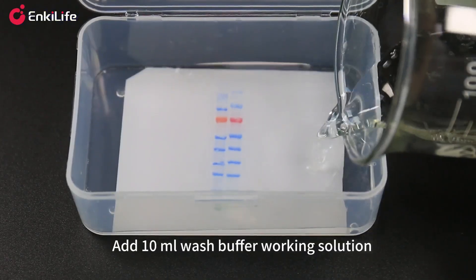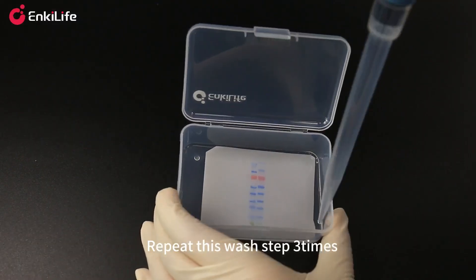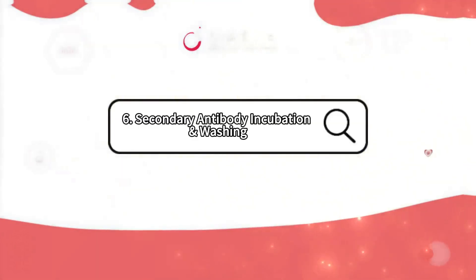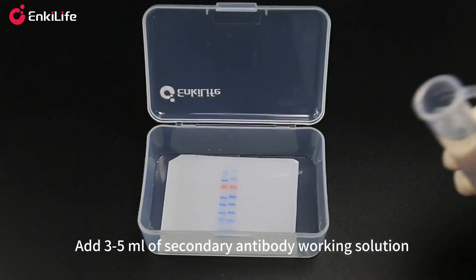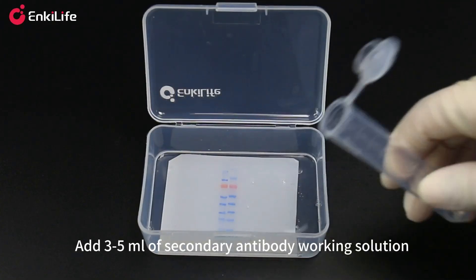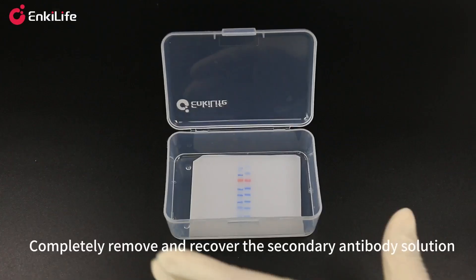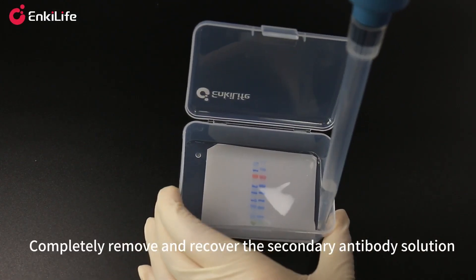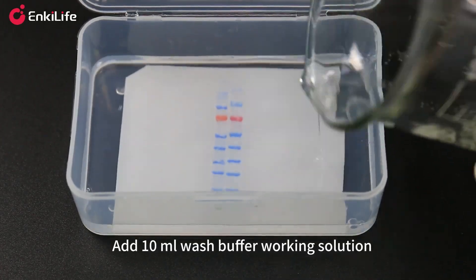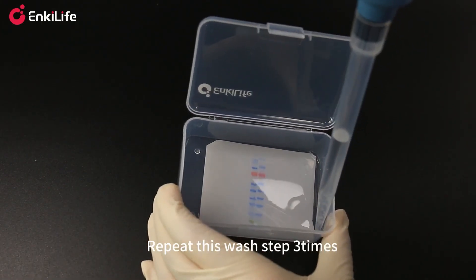Add 10 milliliters of wash buffer working solution and wash by shaking for 30 seconds; repeat this wash step three times. Add 3 to 5 milliliters of secondary antibody working solution and incubate at room temperature on a shaker for 5 minutes. Completely remove and recover the secondary antibody solution, then add 10 milliliters of wash buffer working solution and wash by shaking for 30 seconds; repeat this wash step three times.